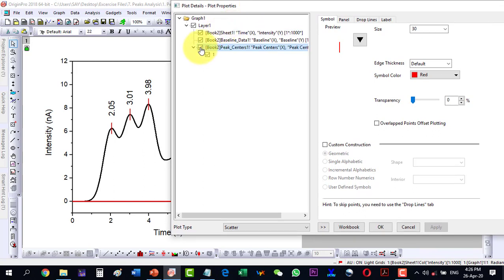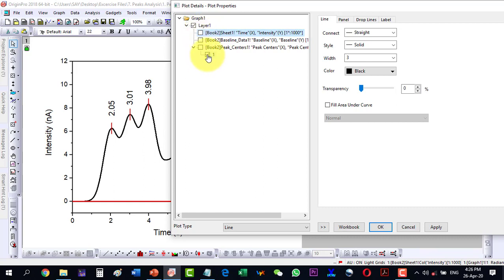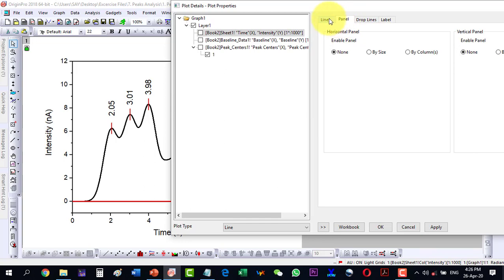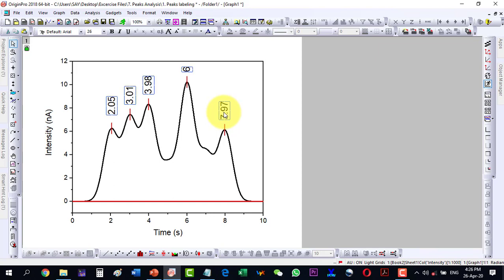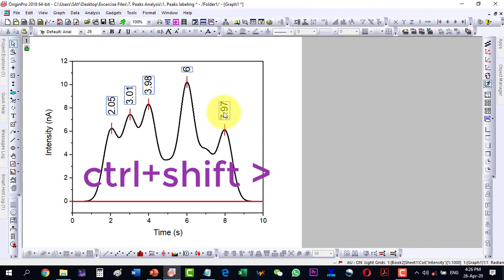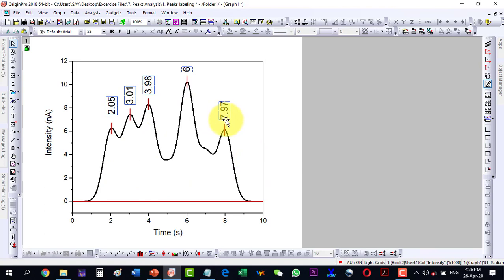If I want to change only one, I will have to unselect all of them and then select only that one to change it individually. For all of them, we can change their size by selecting them and then using Ctrl+Shift and the greater-than key to increase the label size.